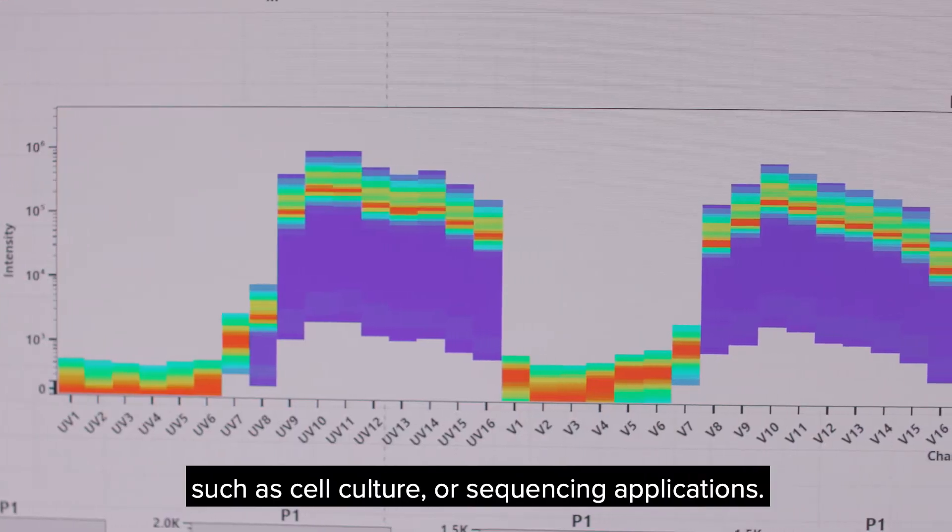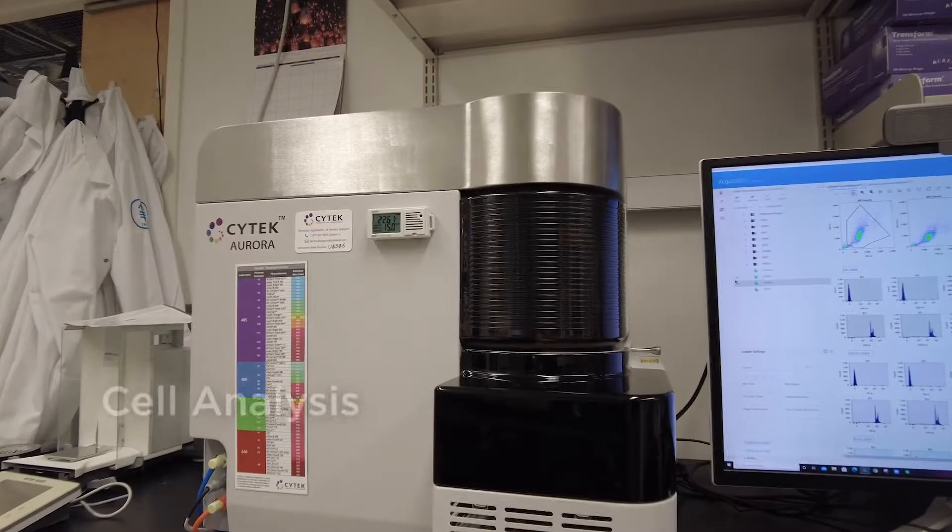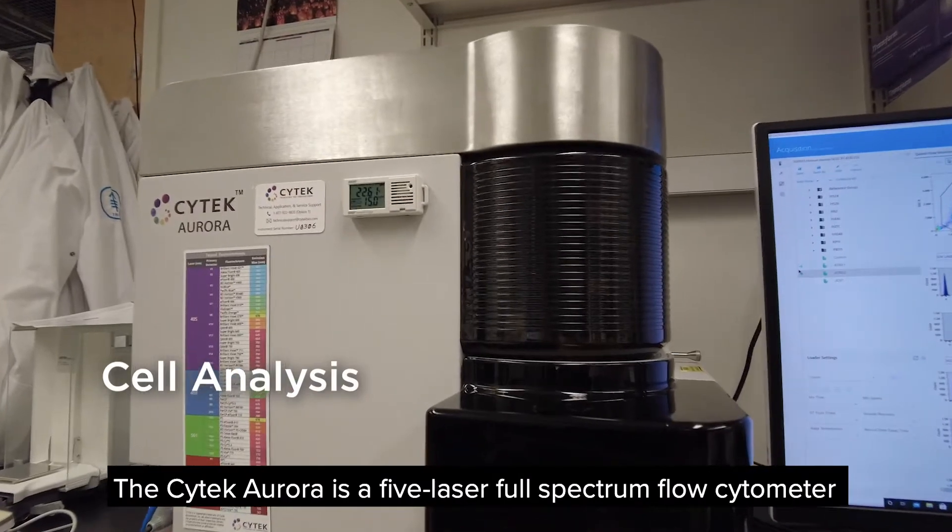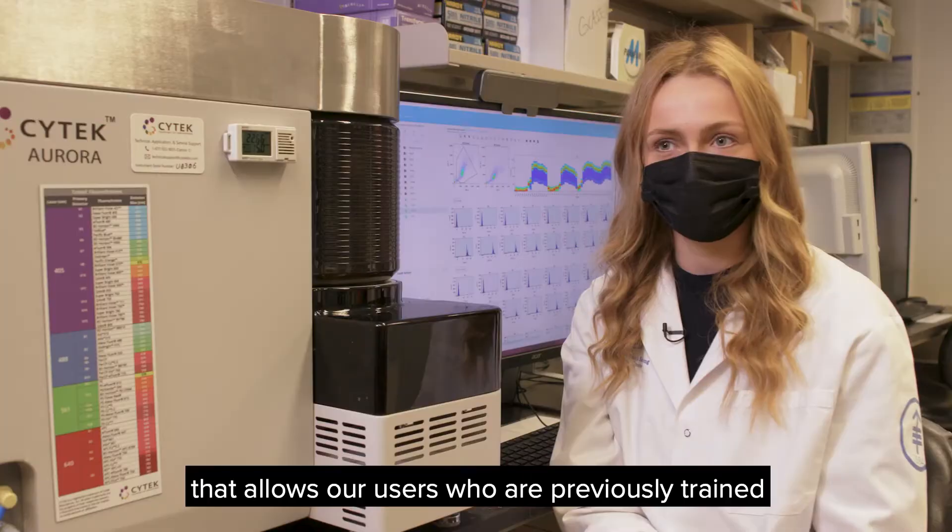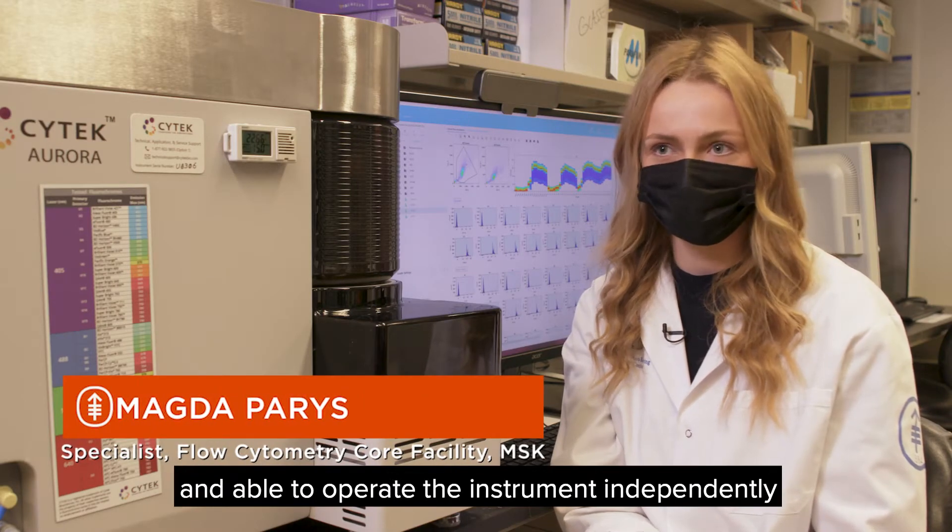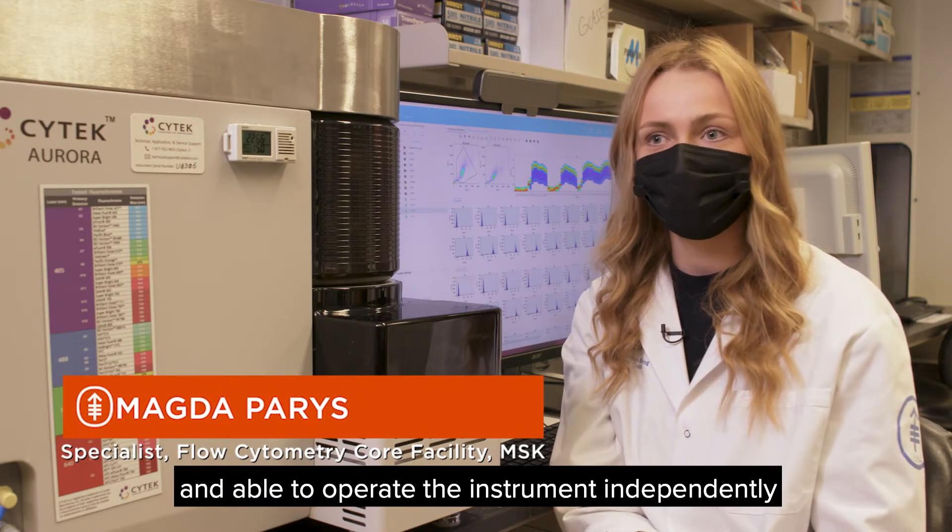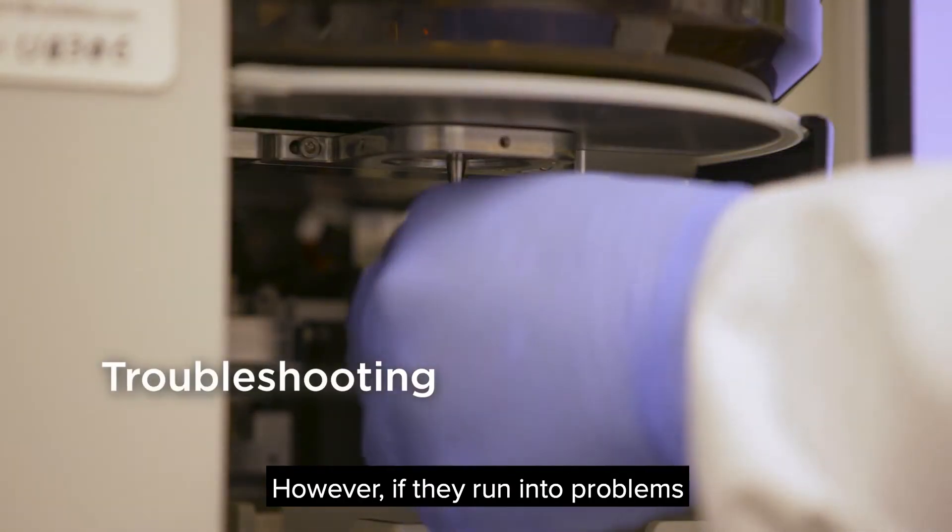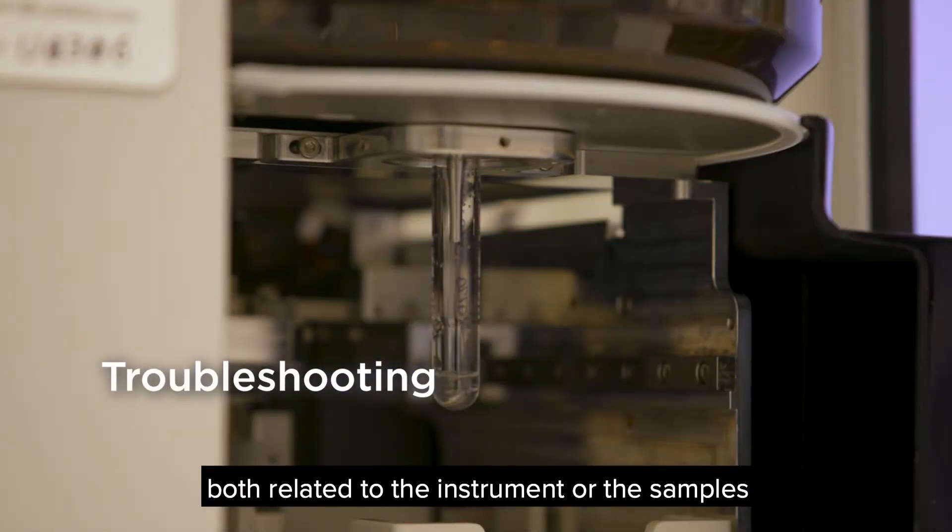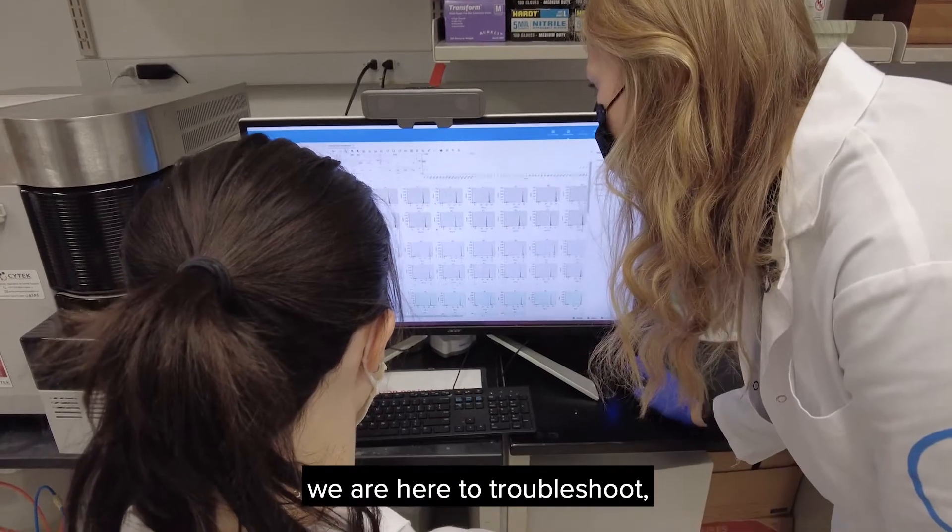The Cytek Aurora is a five-laser full-spectrum flow cytometer that allows our users who are previously trained and able to operate the instrument independently to acquire flow cytometry data. However, if they run into problems both related to the instrument or the samples, we are here to troubleshoot but also to provide our suggestions and advice for further improvements.